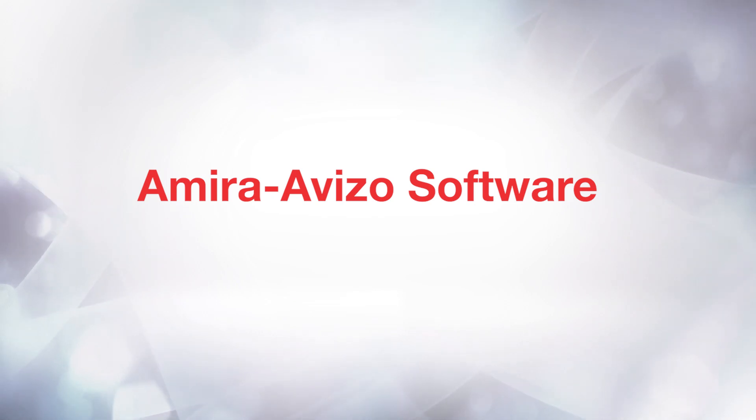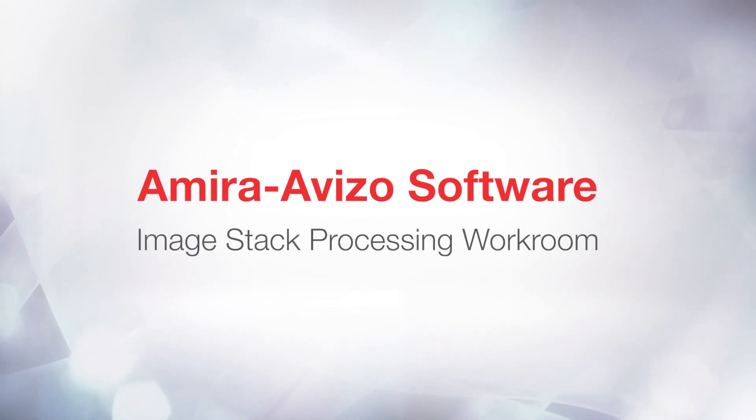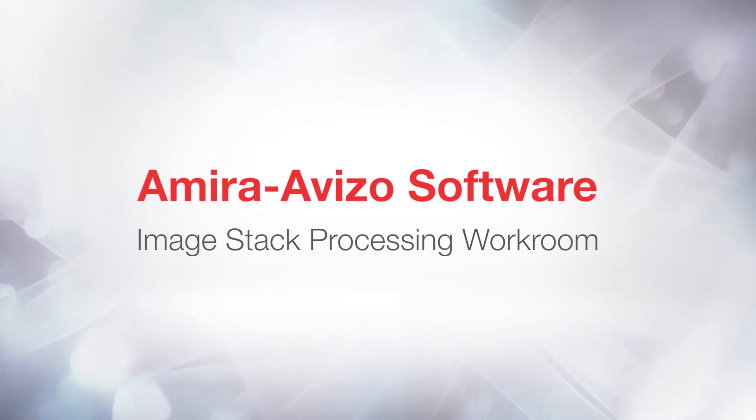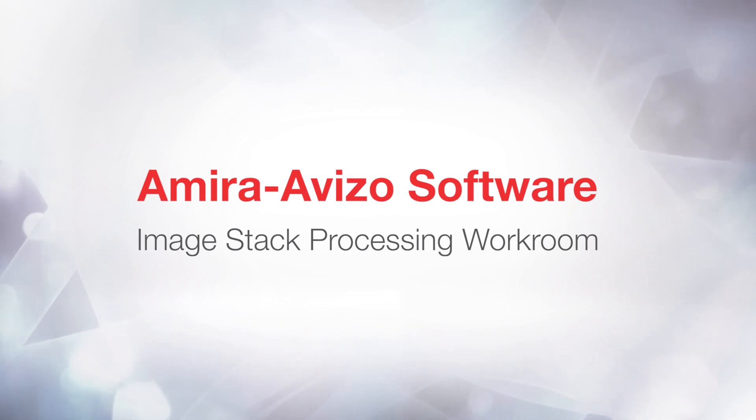Hi, this is Severine from the 3D Applications team. The Image Stack Processing Workroom is a very intuitive and optimized 2D setup to enhance and segment data in Avizo and Amira.